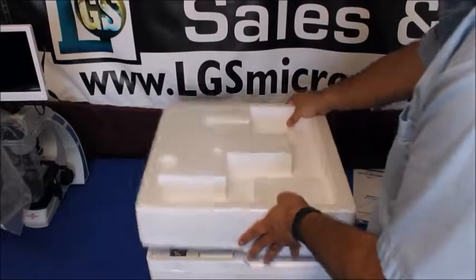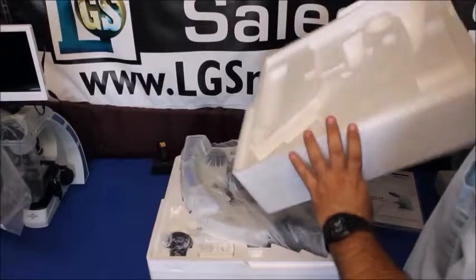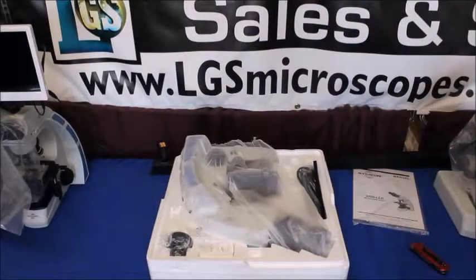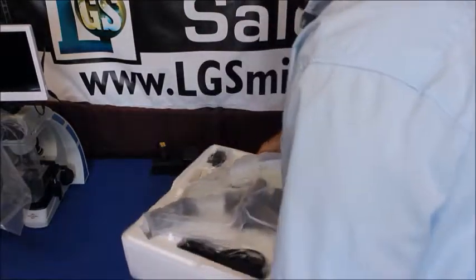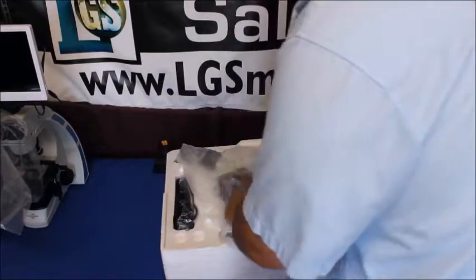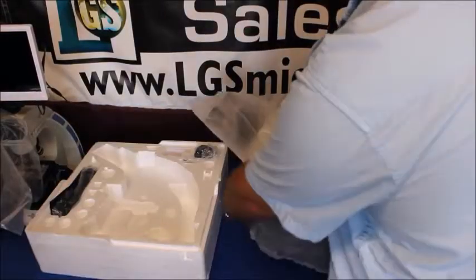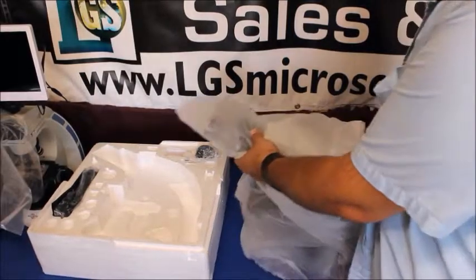Okay, take this part off, make sure there's nothing in the top there. All right, put this around so it's easier to see. Here's the main microscope and this is just a temporary cover so you can pull this off.